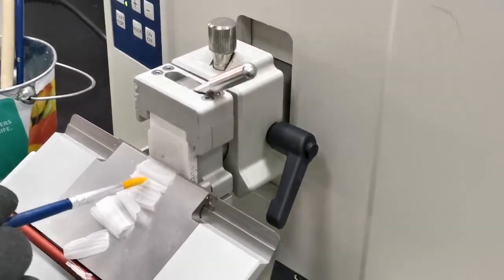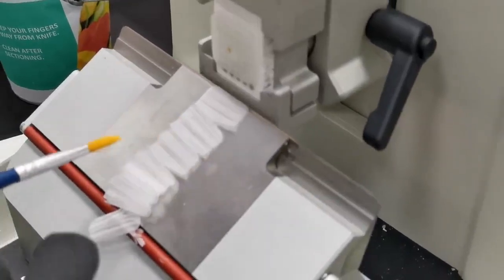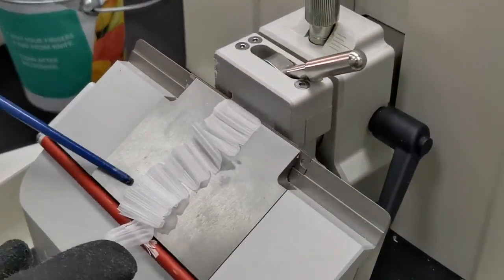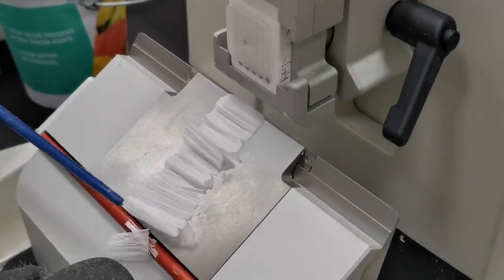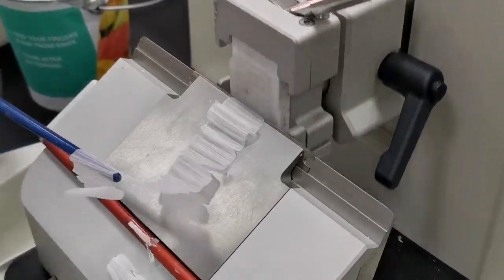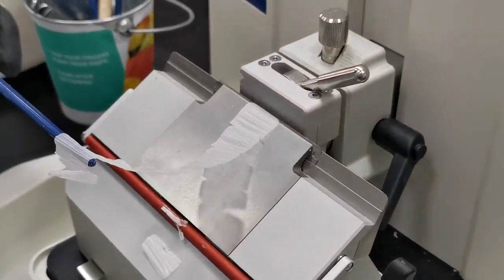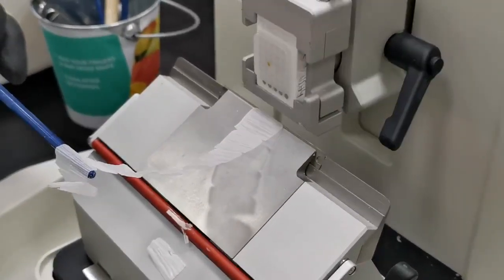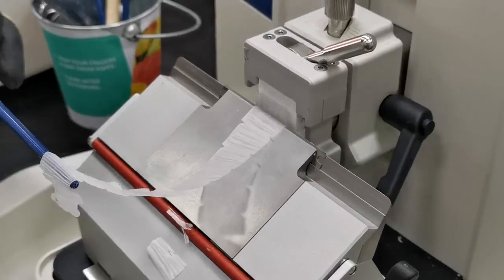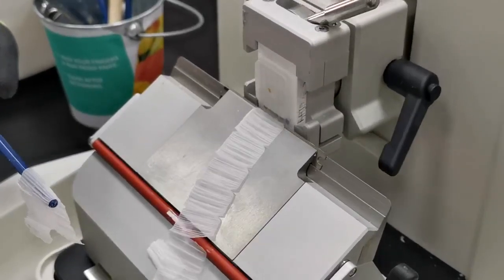You can see the tissue in the middle. Now you are producing a ribbon of sections. Later on, you need to put them on a water bath, or maybe with a drop of ethanol on the slide, and then load them onto the slide. Thank you.